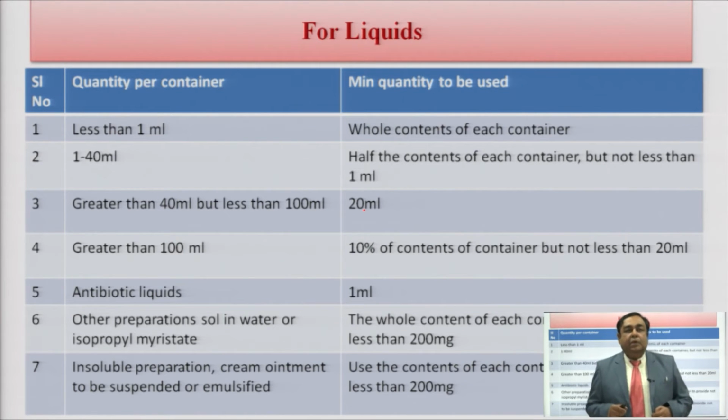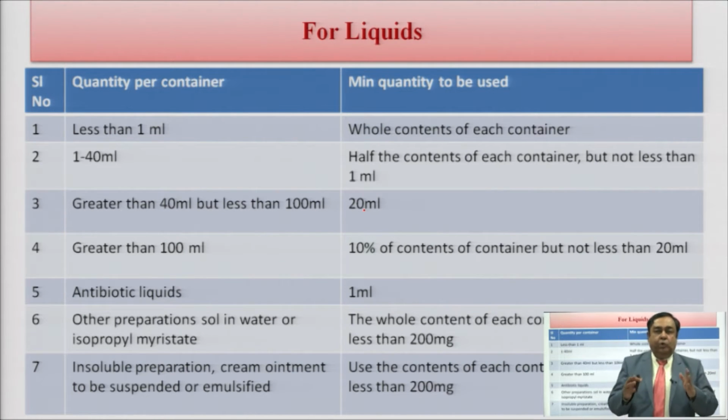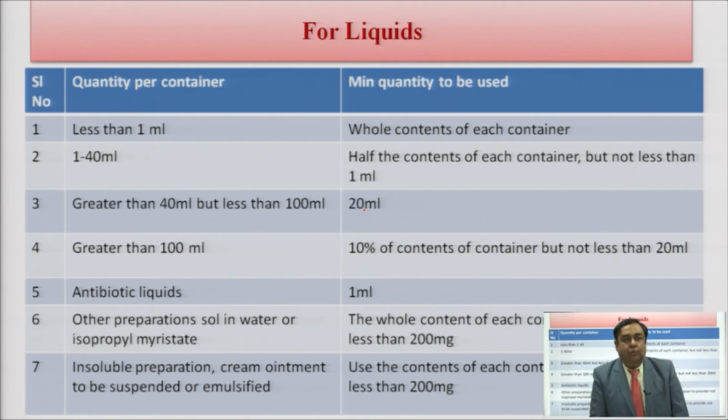However, if the final preparation has a volume of more than 100 ml, in that case you have to take 10% of the volume of the final container, but it should not be less than 20 ml. So, these guidelines are laid down as per the Indian Pharmacopoeia.